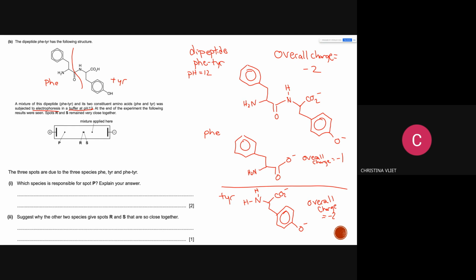So the mixture was applied right there. This is the negative end. This is the positive end. All three of your molecules moved towards the positive end. But one moved much farther than the others. Which one moved much farther, Francesca?